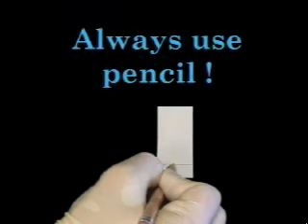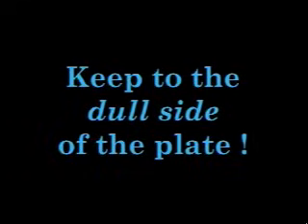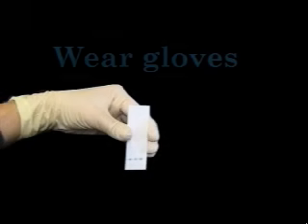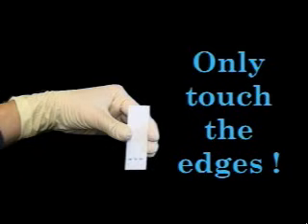Before you start, there are a few things to remember. Always use a pencil and never a pen to mark your TLC plates. Ink is soluble in organic solvents and will be developed along with your sample. Make sure that you always mark and spot your sample on the dull and not the shiny side of the TLC plate. Remember, the dull side is coated with the adsorbent. Even though you should be wearing gloves while handling TLC plates, it is important that you do not touch the face of the plate with your fingers. Oils from your skin or other contaminants can adsorb to the plate and affect your results.